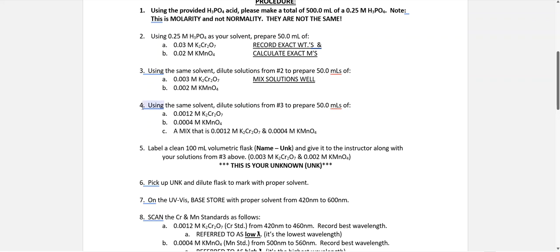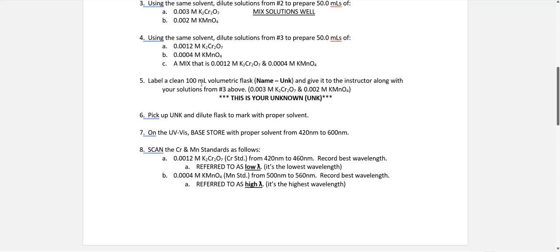That's the same concentration. Number five says give me a flask or a laboratory instructor, and we will make our own mix. We're not going to tell you how much we used of each one, and then we gave it back to you. You topped it off with the proper solvent, inverted really well, mixed, and ran them. Number six, we diluted that with proper solvent.